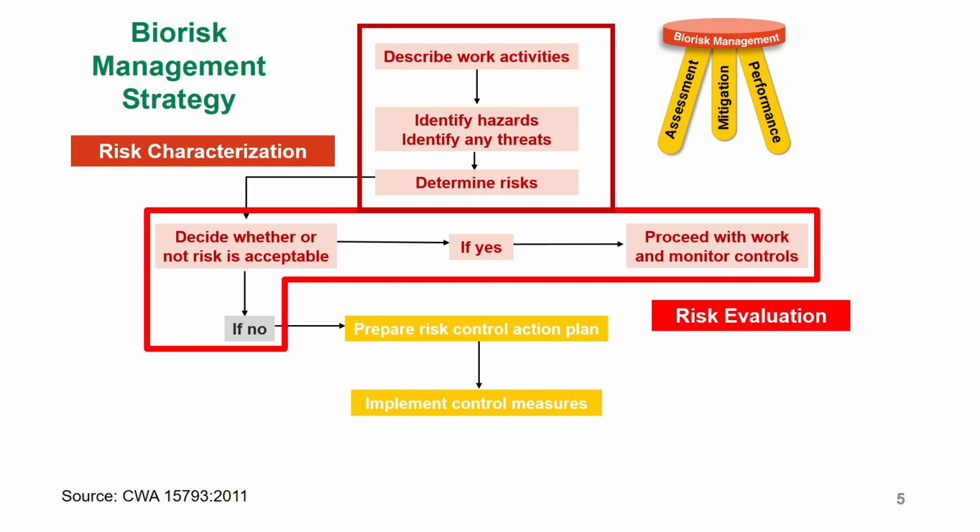So in this case, you may say, okay, we need new infrastructure, which means we need to build maybe a level 3 or level 4 type of facility, or you need to put up certain containment barriers that you may not have. Maybe at the time you're doing risk assessment, you only had a class 2A2 type of biological safety cabinet. But then if you need to handle Ebola, you need something which offers a bit more containment. In this case, maybe you may need a class 3 biosafety cabinet. So you redesigning your lab and you getting that containment device are proposed control measures.